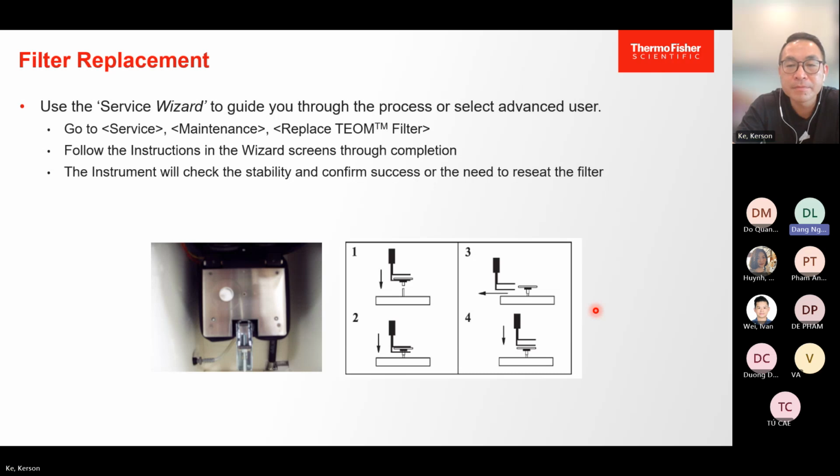Because as I know, although they do not have to replace it every day, maybe once every quarter, every three months, they have to replace the filter. Yes. But I think it's quite easy to train, because when I first used it, as a university student, you just try once or twice, then you will know how to replace it.